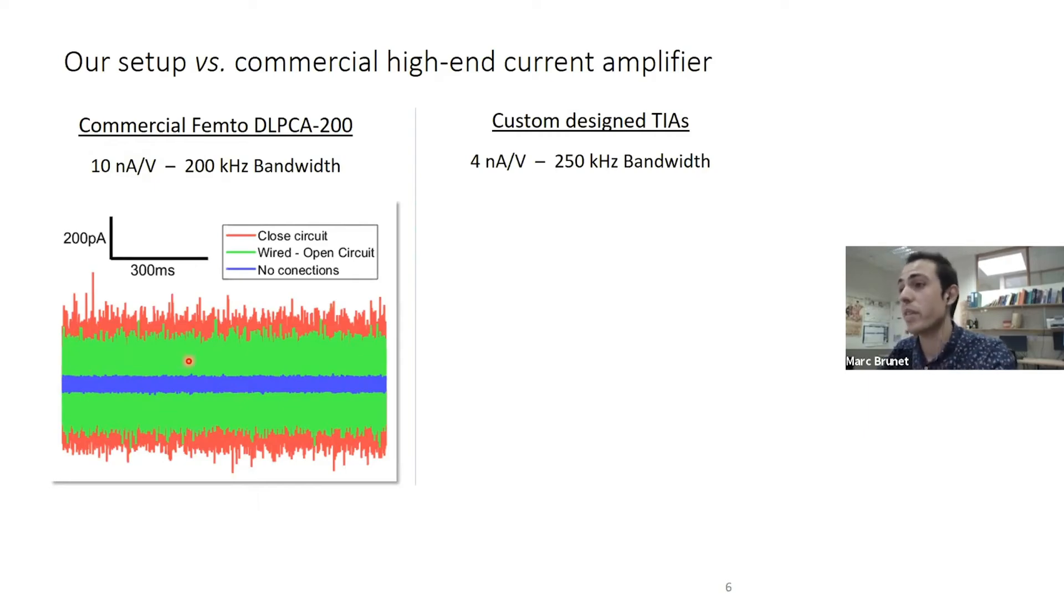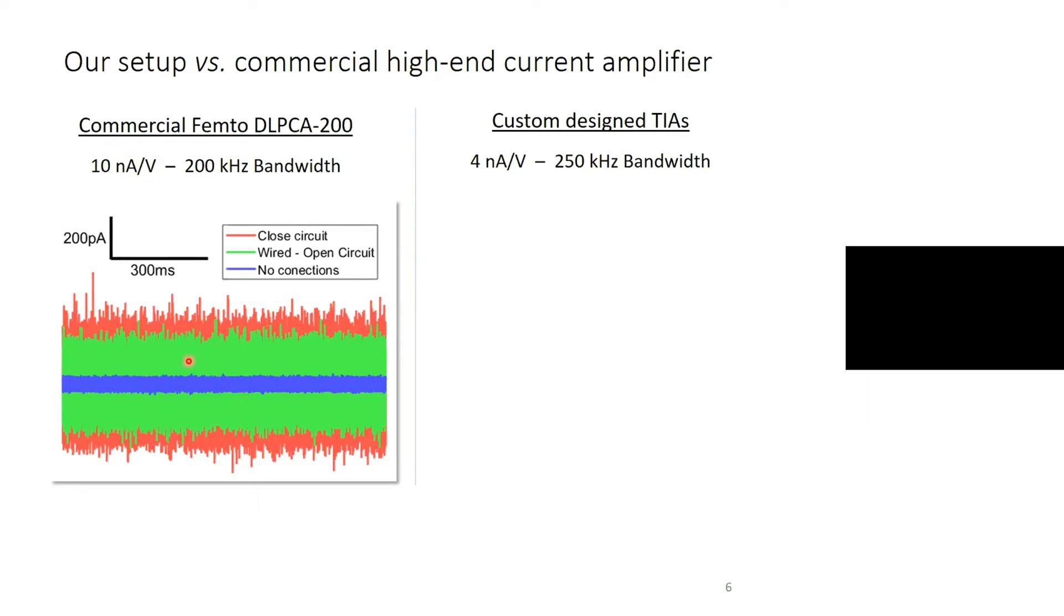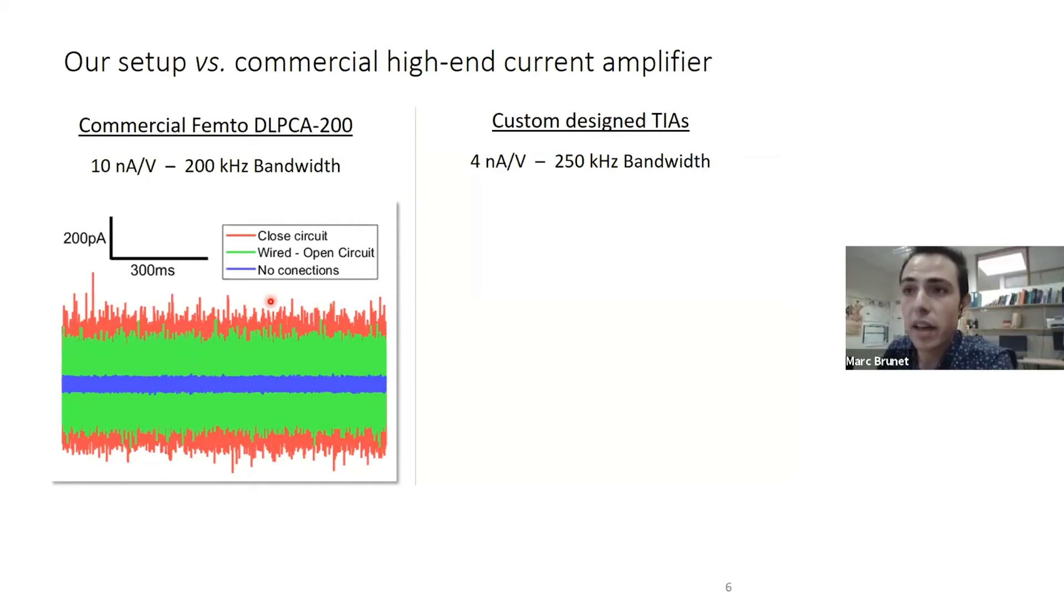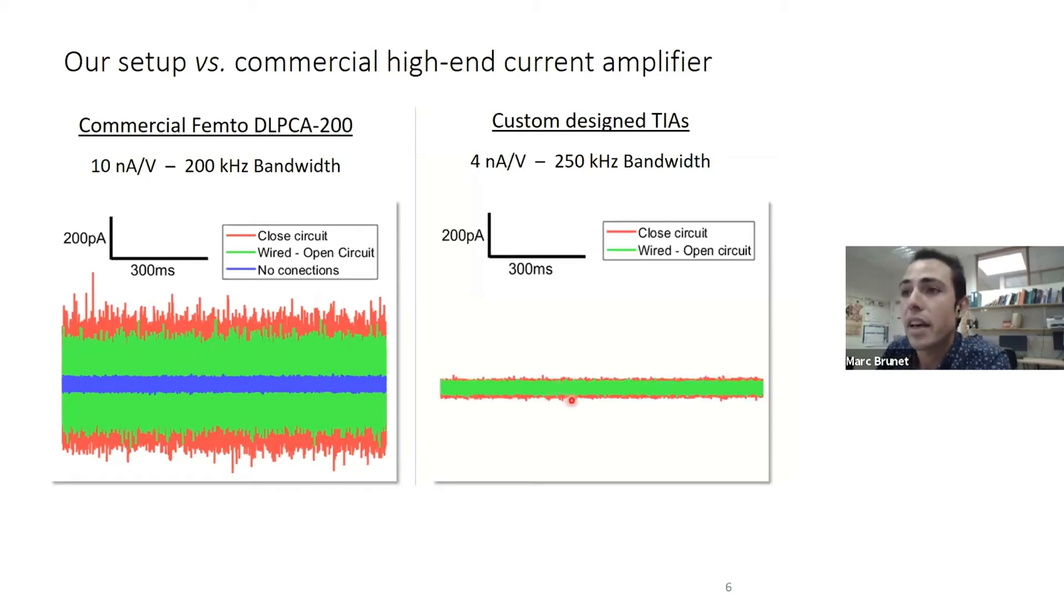When we add all the connections to make a two-electrode cell, the noise increases very significantly to the green trace we have here. As mentioned before, this is due to all the parasitic connections from the wiring. In red, we have the current trace when the cell is formed.